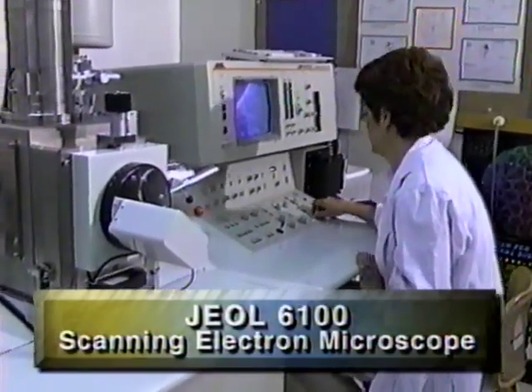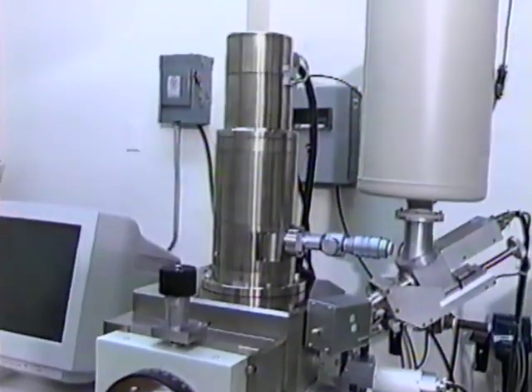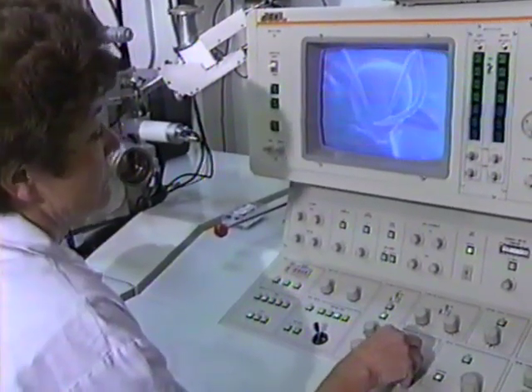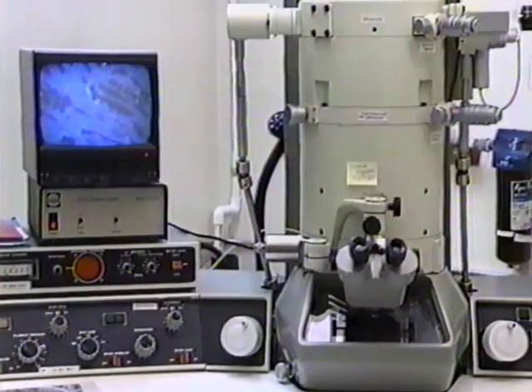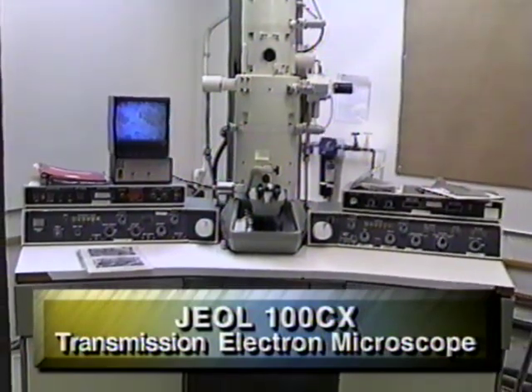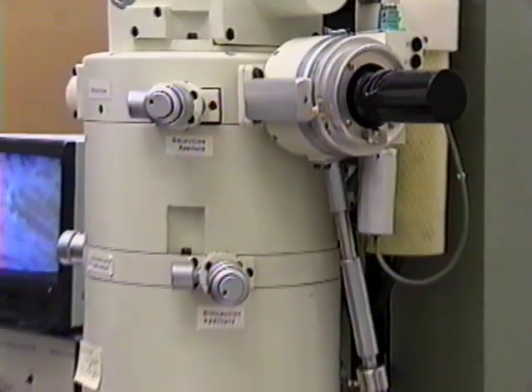Right. Now this is some of that specialized equipment, and one of the things I know that you have to do is to get a lot of this equipment donated, because these are not cheap pieces of equipment. You might give our audience an idea of what it's going to cost for some of that equipment as we're zooming in on. Is this an ant? This is an ant on a scanning electron microscope that scans across the surface to get the image where we can look at surfaces. This is a JEOL, this is actually a transmission microscope where we look through samples.